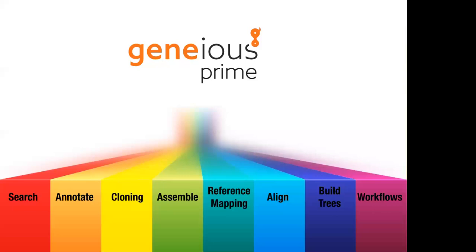You can also work with Sanger sequences or NGS data in Geneious, so bring in your ABI files or your FASTQ files.